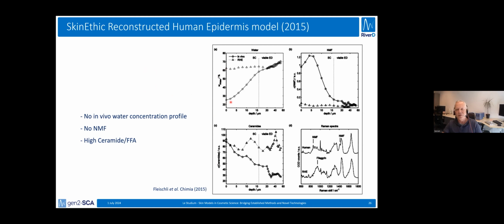They did not find the typical water concentration profile of in vivo skin, as you see here, but instead found basically no profile at all. Also here, the NMF was lacking in the skin model, and also here, the lipids were quite a bit higher than you would find in vivo skin.